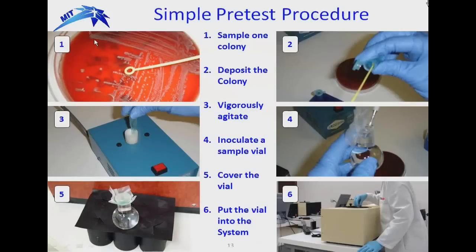The overall majority of bacterial identification methods begin with colonies on culture plates. Our method also begins there. Here's a photograph of a culture plate with bacteria growing on it. These individual gray spots are colonies of bacteria. A colony is a visible cluster of cells, all descended from a single cell. Since the cells descend from a single cell, they are genetically identical. The colonies are a result of the procedure used to streak the sterile culture plate with a microbial specimen.